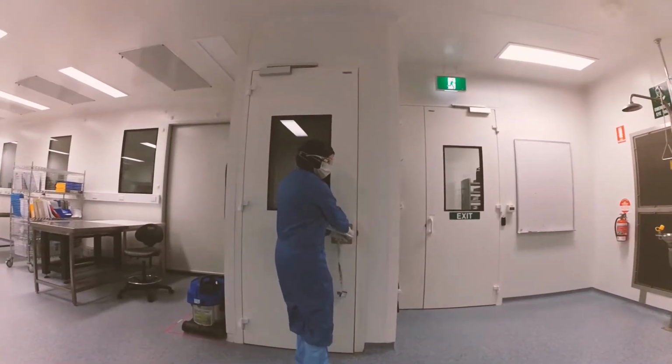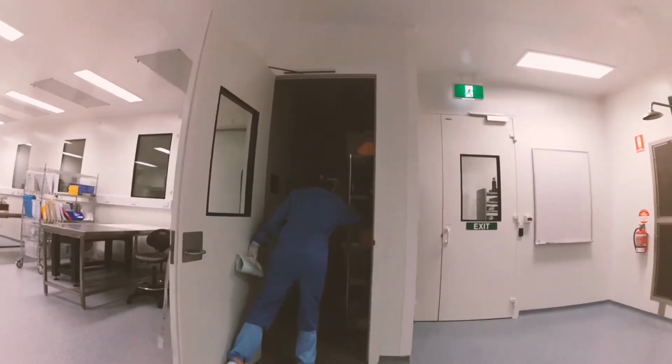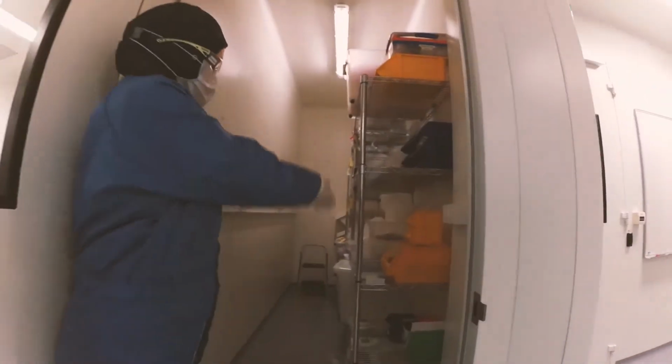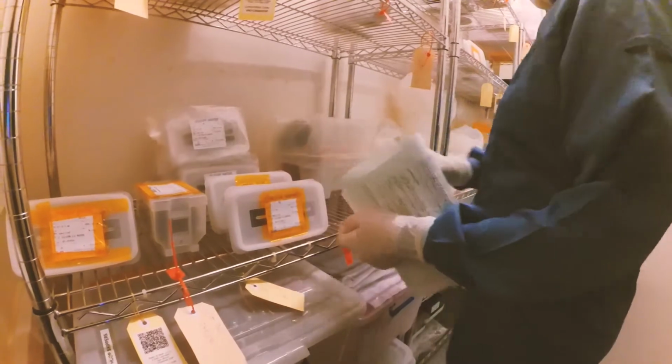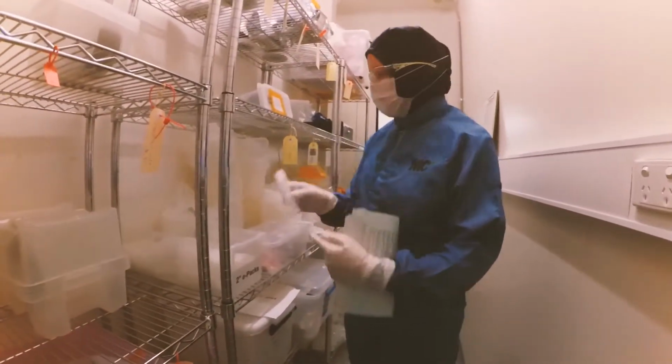Consumables such as sample containers, wafers, chrome masks, gel packs, and tweezers are available from the clean room store. If you need any items from the clean room store, place the order on ACLS. Show the order number to a staff member and they'll retrieve the items for you.